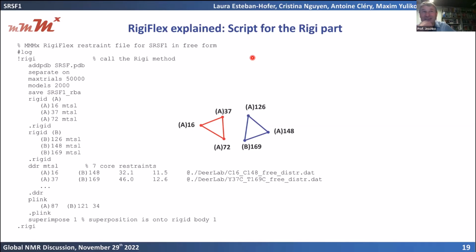Basically, to solve this problem, we should have not only one ensemble model, we should make a large number of ensemble models and then see how much the different ensemble models deviate from each other. And we are not yet at this point. We are working on this.